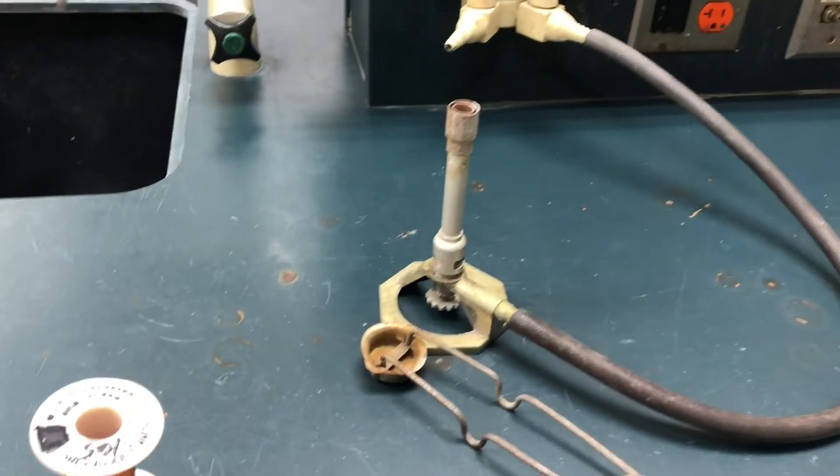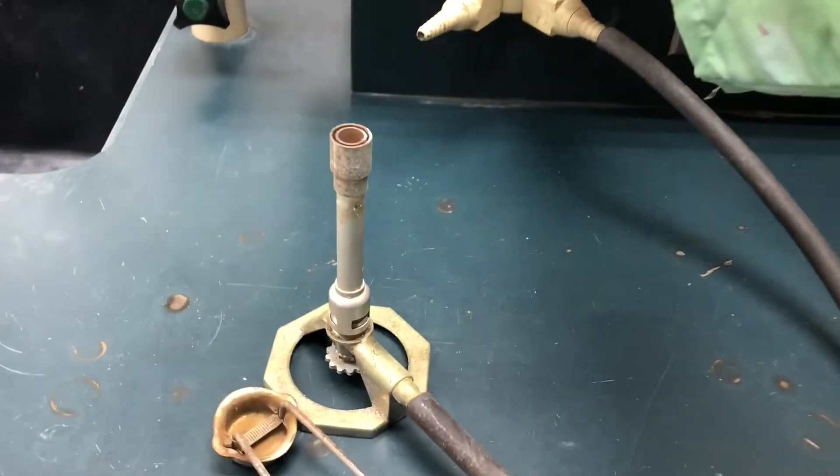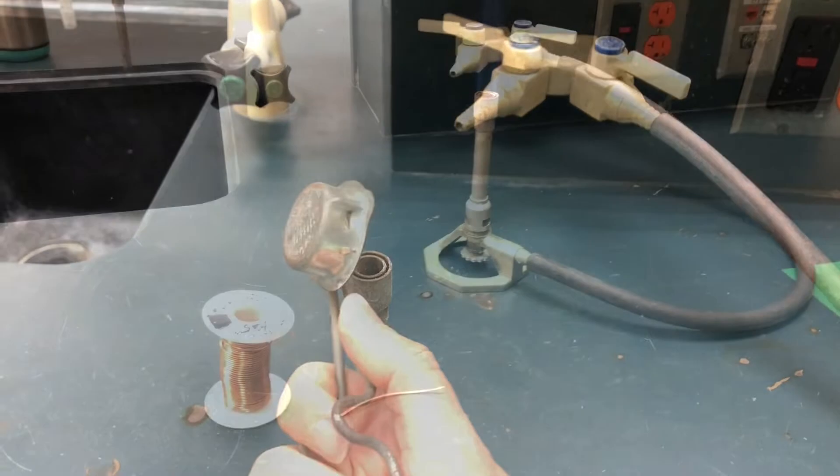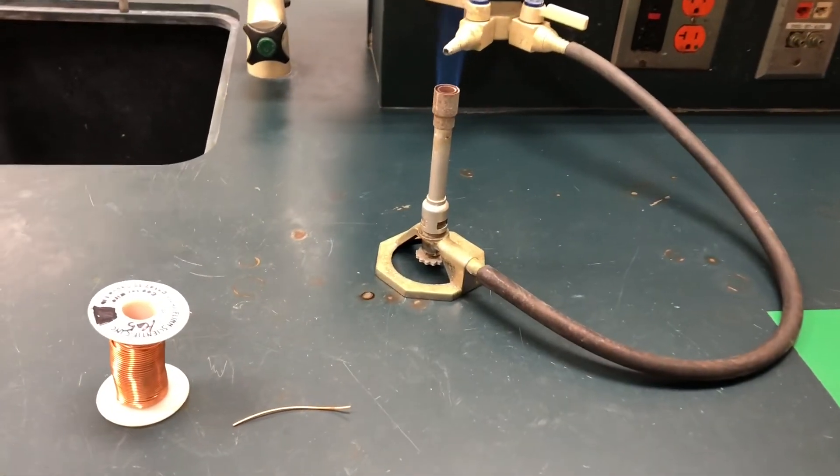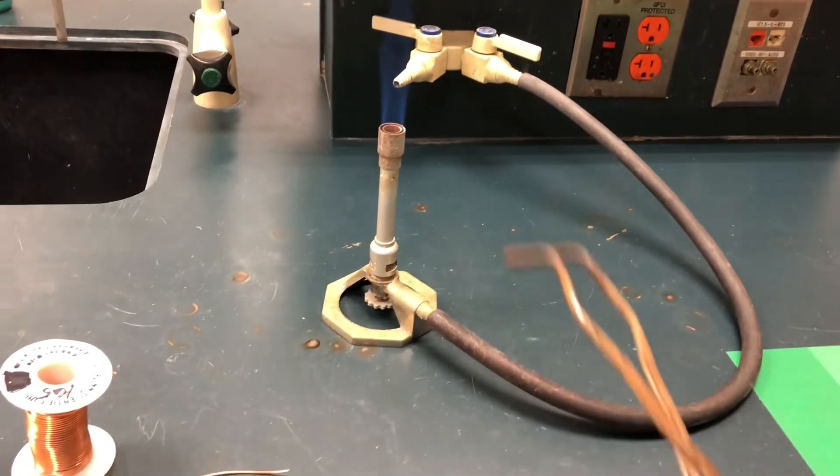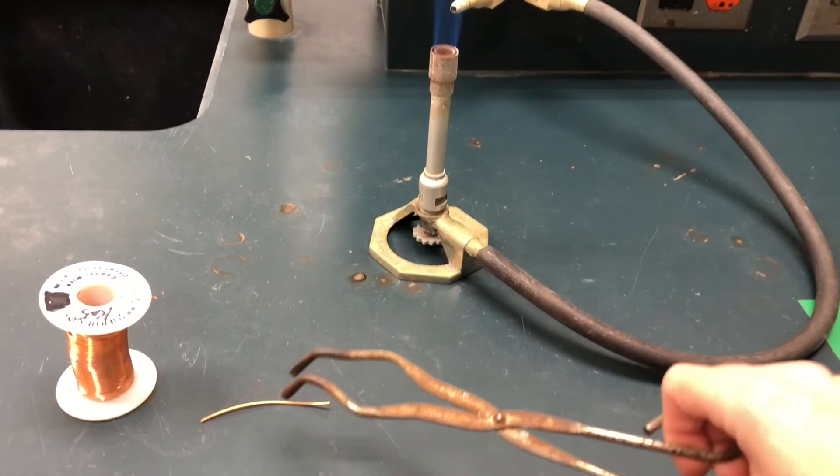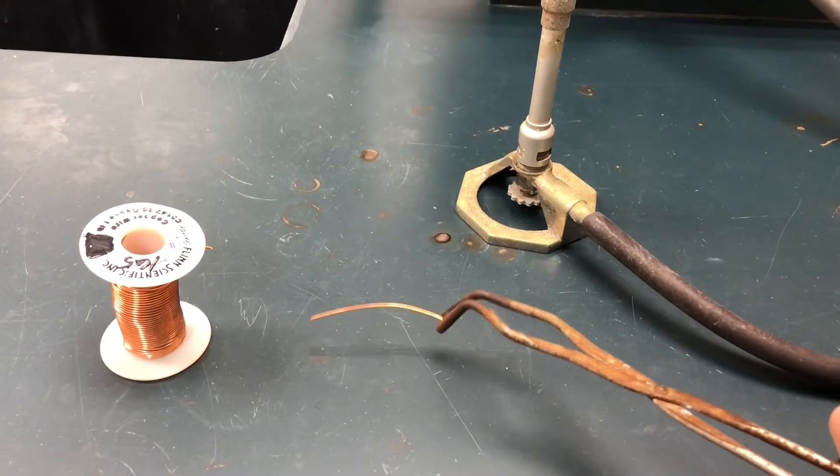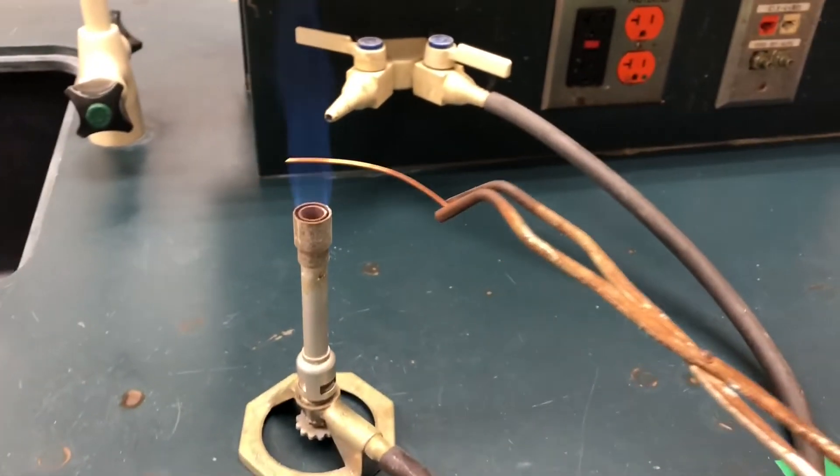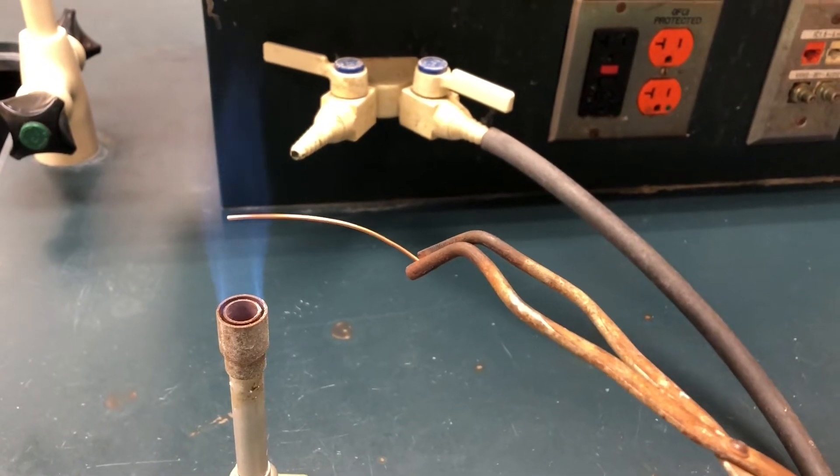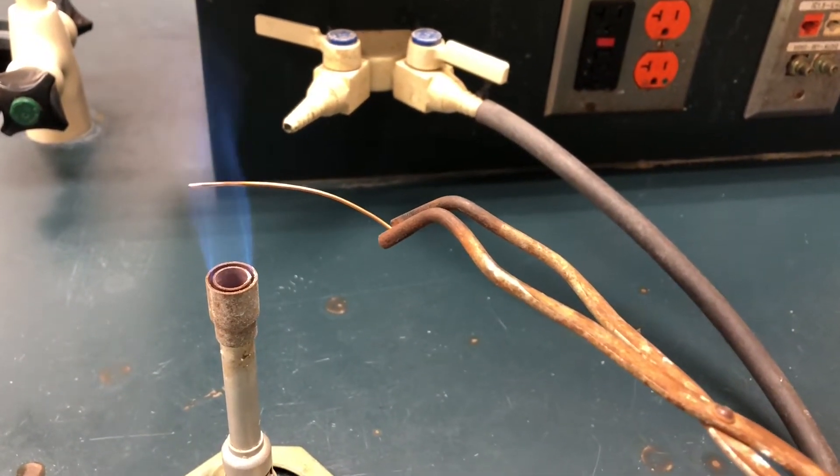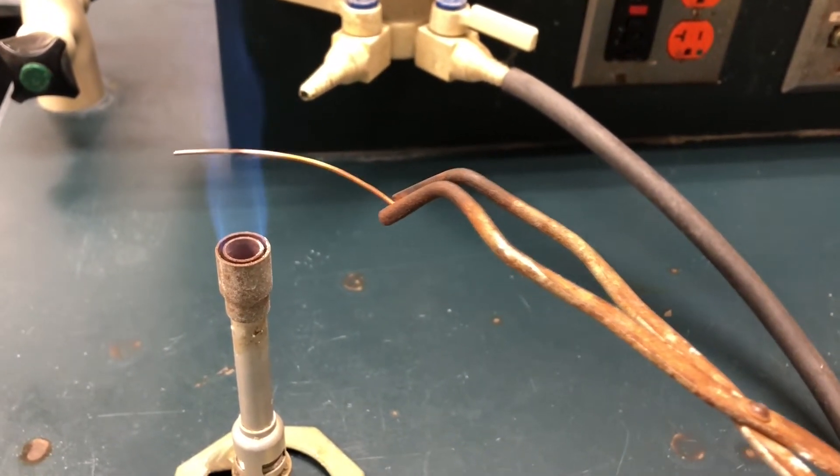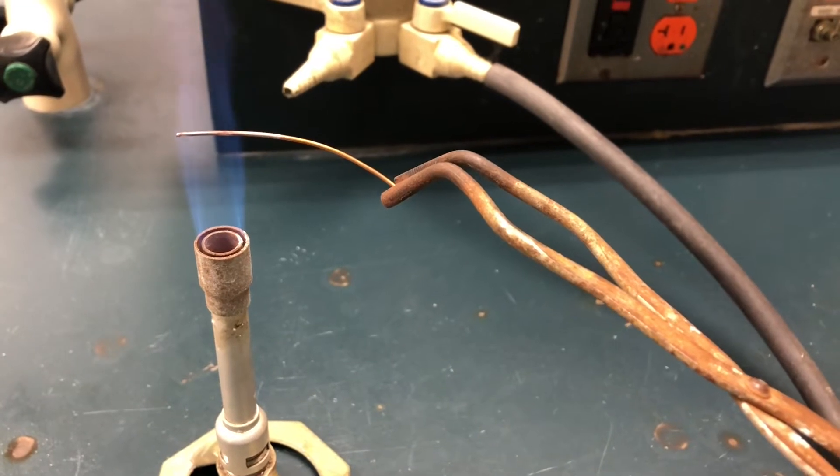Next I'm going to light my Bunsen burner. I'm going to take my copper wire and put it inside the flame of the Bunsen burner. Using crucible tongs I'm going to pick up that shiny copper wire. I'm going to place it inside the flame and now you can start to see immediately that there are some changes happening to this copper wire. I'll heat it up for about a couple minutes here.